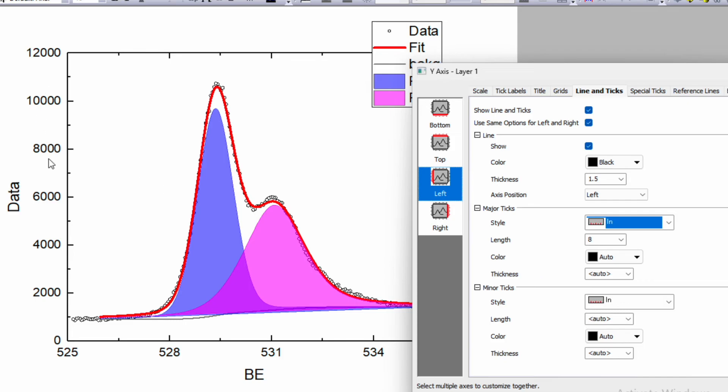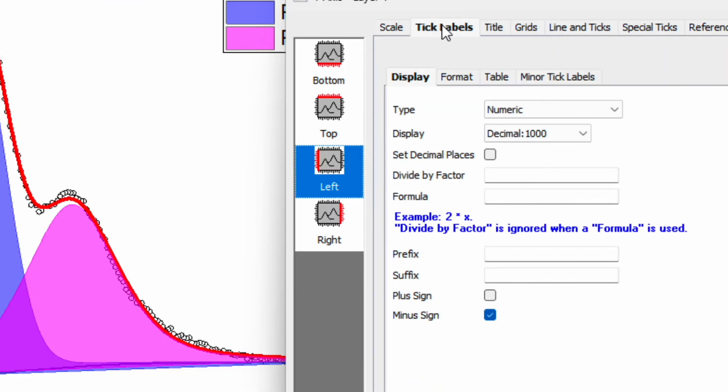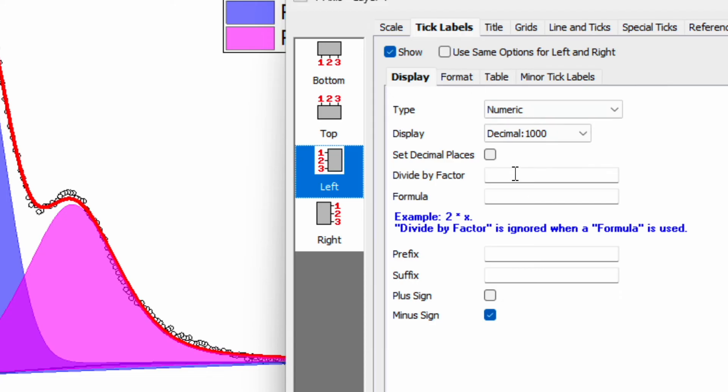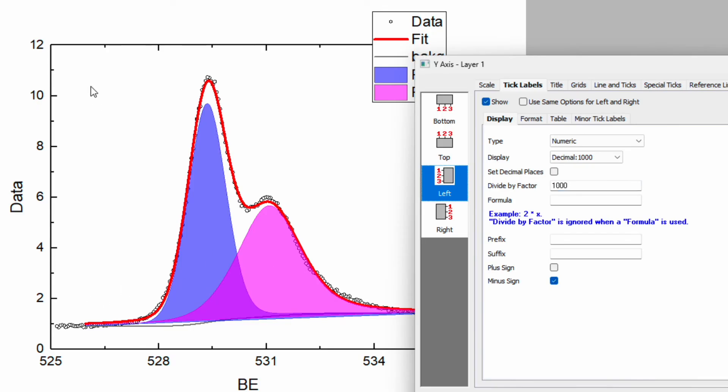Now here you will see this number is huge, so you can go to the tick label as well. And over here you will see option for divide by factor. Divide by 1000, and then number will be reduced to 0 to 12.